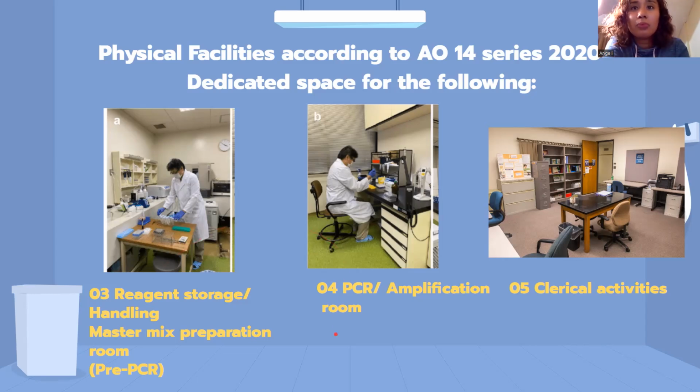Now, here we have the PCR amplification room. So, ang main na equipment dyan, hindi ba yung thermocycler and RT-PCR, if it's an RT-PCR facility. So, itong AO14, RT-PCR ang nire-record yan. RT-PCR, okay? Kasi nga COVID-19 testing yan eh. Tayo sa school lang tayo.